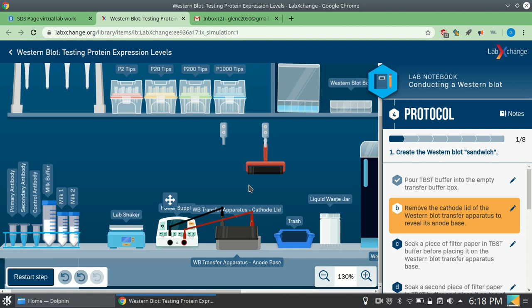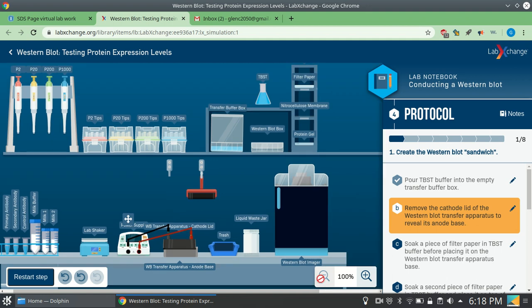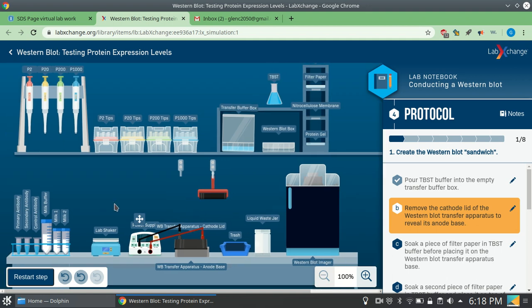All right. Now, you can express yourself as you do this lab work. I mean, expressing yourself, just sort of optionally. It's just something that you do to make the lab work more interesting for you. So there are some things in here by which you could express yourself, and let me show you what those are. For example, when you obtain some stuff, you can close the cap.